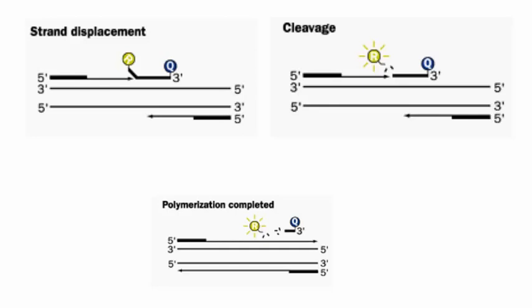So there's a reporter and a quencher molecule that are attached to this little DNA probe that's also going to be binding to the target. So remember, this is your long 2 strands of DNA that you want to amplify. Here's one primer. Here's another primer, and this is going to be the regular type of PCR that we talked about.